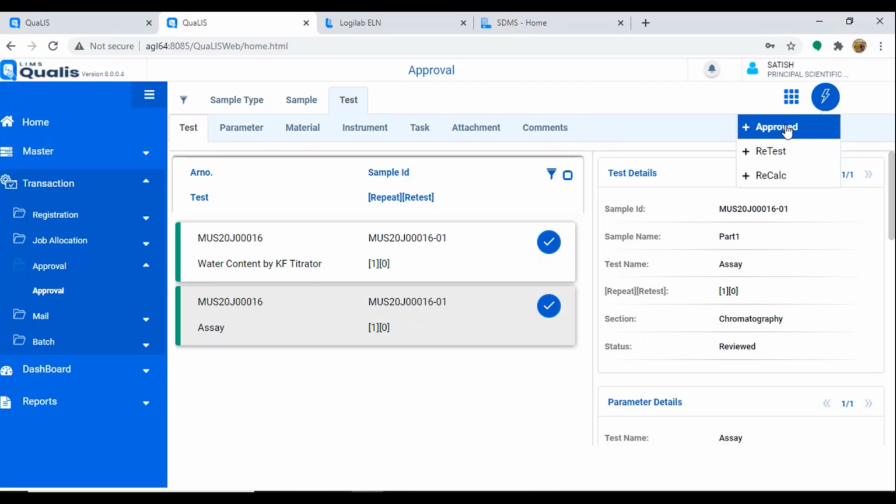New is created and then after the retesting, the final authority will decide what to do with the retest, whether approve that also and say we conducted it twice and send all the results, or cancel the previous one and only report the last one. All options are available. So either they can cancel the old record, or they can send the old record also along with the new record. All are possible.